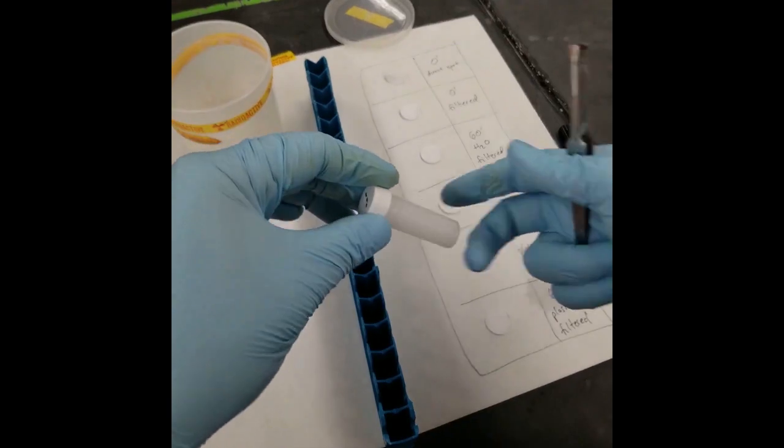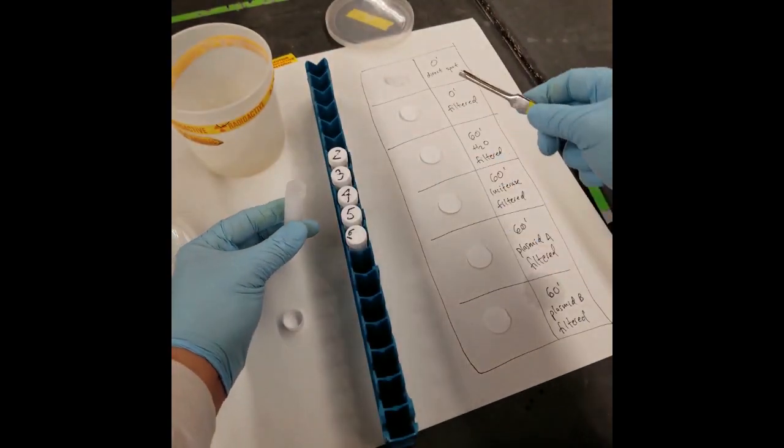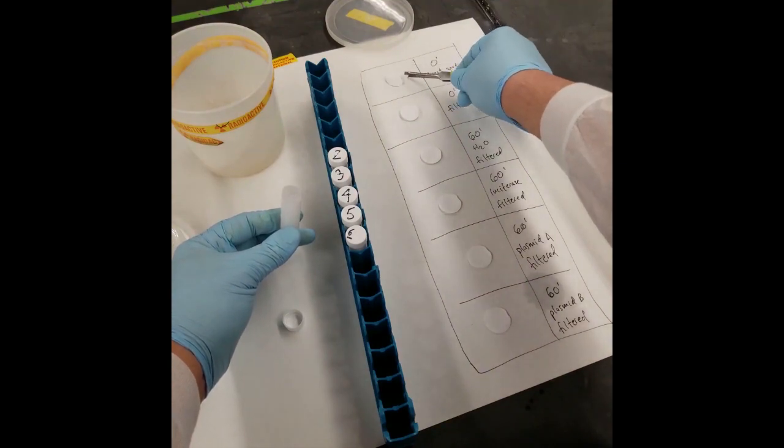For each vial, take the matching filter paper with your forceps and place it inside the vial, making sure that the filter paper is completely inside.